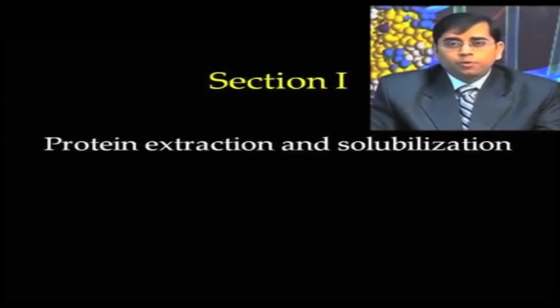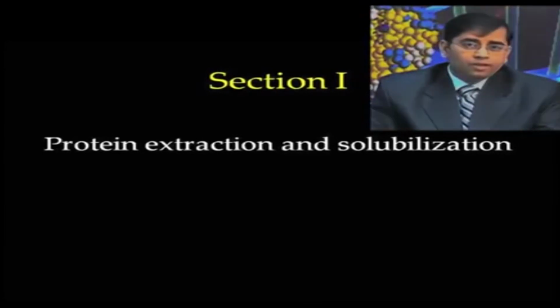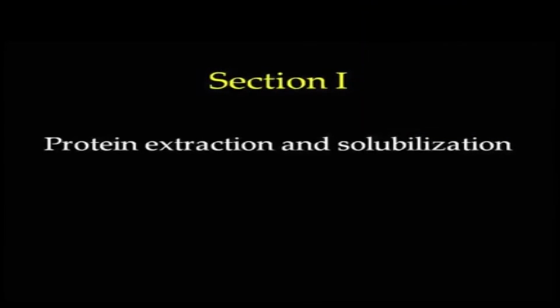Now, this step will be more towards gel-based proteomics, where solubilization will be more important.